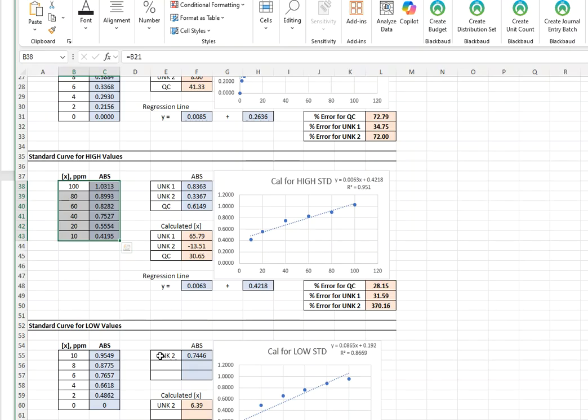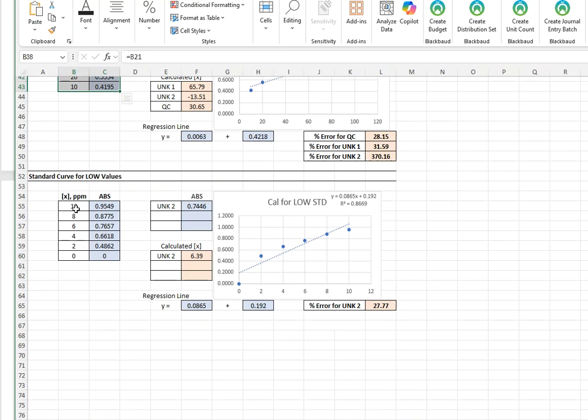I think it cleans up a little bit. It becomes in a way more linear, and the numbers might be a little more reliable. And then we go to our standard curve, and this is where we rescaled and reset the machine to make it read 10 as the 1 absorbance, and then from that we read everything else.